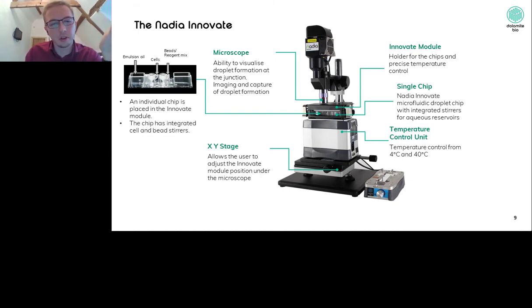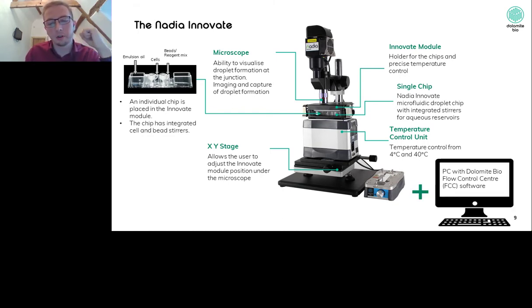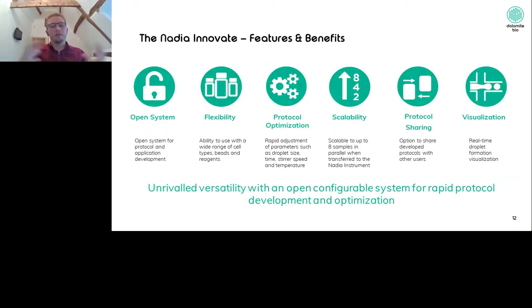What this allows us to do with the integrated flow control software is that we can play with different settings to do with pressure, to do with temperature, and to do with stirrers to see whether we can maybe improve on the microfluidic aspect. So if you've got, let's say, big cells, we can decrease oil rate, things like that, in order to get the droplets bigger. If you've got cells which are only happy in a particularly sticky buffer, something which happens a lot when you get towards niche cell types, then we can account for that buffer thickness by altering the pressure levels of those different buffers.